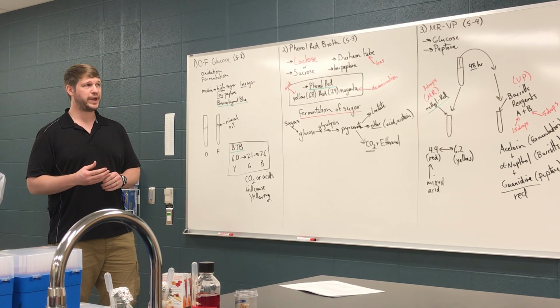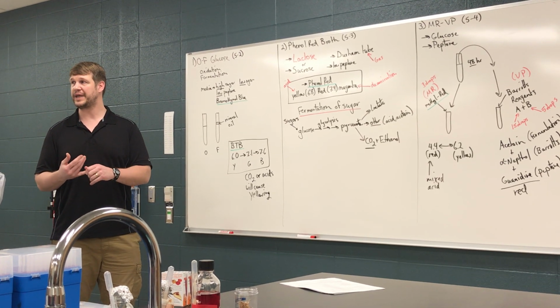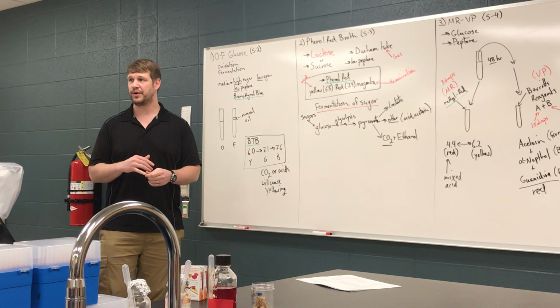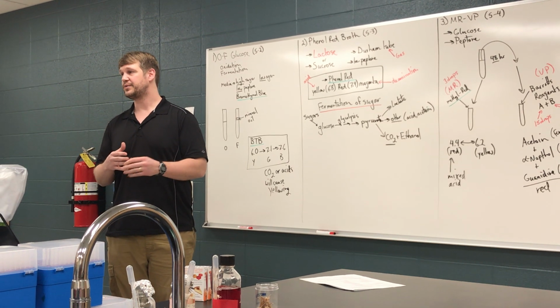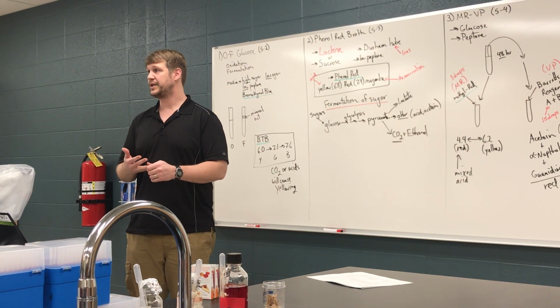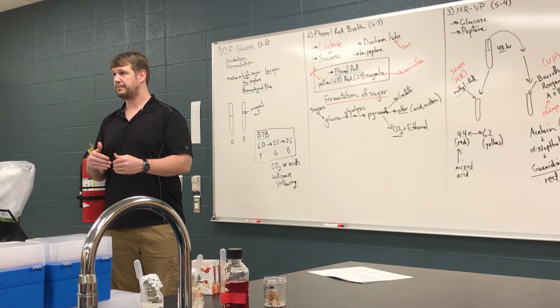And there's two basic mechanisms for indicating their status. One is to use a pH indicator. Many times when a microbe is capable of utilizing a substrate, it's going to produce carbon dioxide, which in solution causes the pH to drop, right?